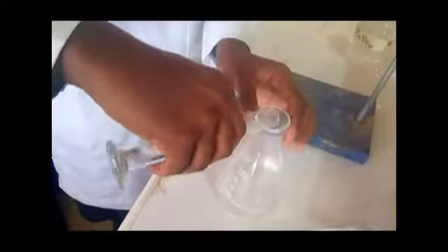cylinder, and right now we are going to measure 10 ml of our dilute sulfuric acid. So this is 10 ml. Now we'll transfer it to our conical flask, which contains our reducing agent. The next step is to fill our burette with our oxidizing agent, which is labeled B.